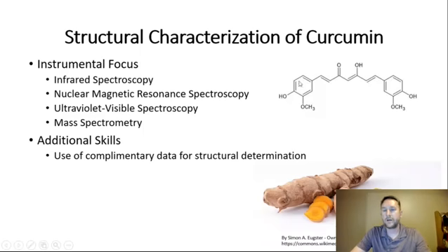So knowing the structure of curcumin, assign the infrared vibrational modes, assign the proton modes in NMR, assign the carbon-13, and so on. And this is also the first time that we're bringing mass spectrometry in, so the students had to introduce their curcumin into a mass spec and look at the electron impact spectra and bring all of these pieces together to demonstrate the structure of curcumin.